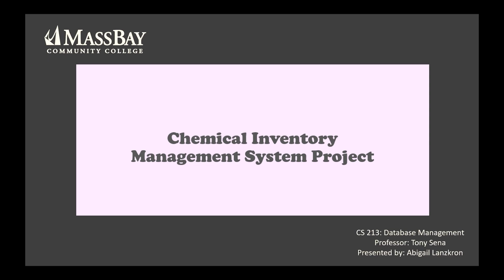Hello, my name is Abigail Lanzkron, and this is my CS213 Database Management Final Project. My project is a chemical inventory system for the Mass Bay Chem Lab.